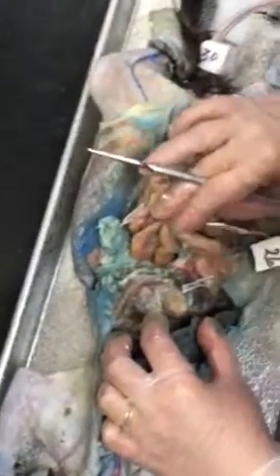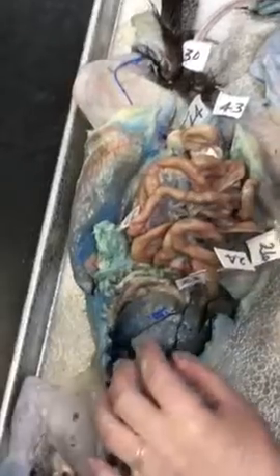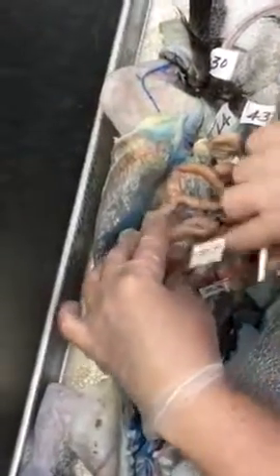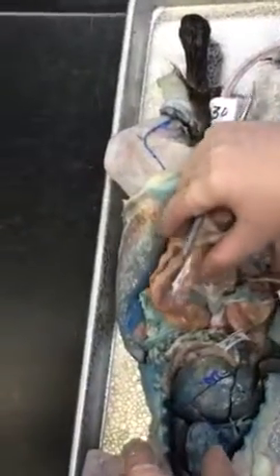You said to show the esophagus too? Yeah, I did. The esophagus was up here. Okay. Yeah. All right. And then from the stomach, we go into the small intestines, which is all of this.